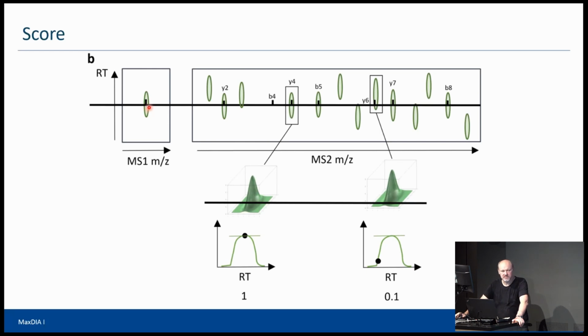They're not always there with at least two isotopic peaks, but we still look for matches also for the peaks that don't end up in isotope patterns. These are actually quite many. That could be 10 times more than the isotope patterns in the data. But to reach high sensitivity, it's important to consider these.